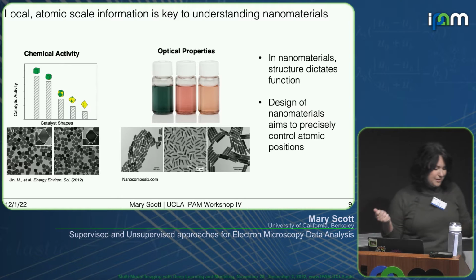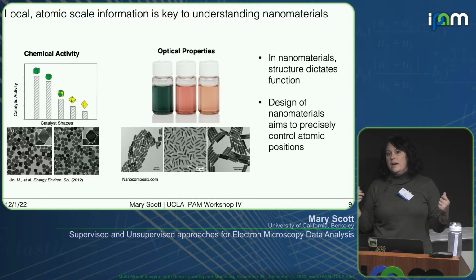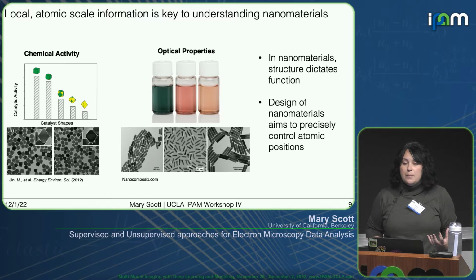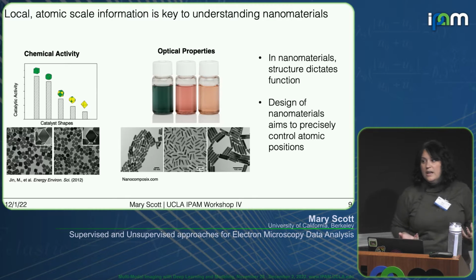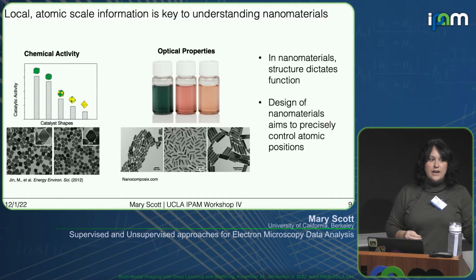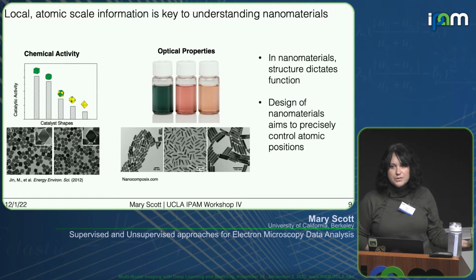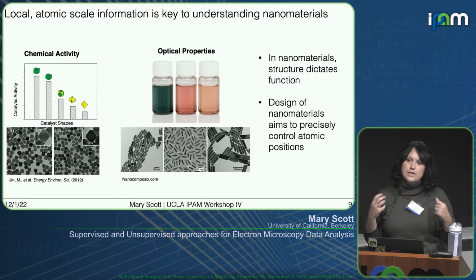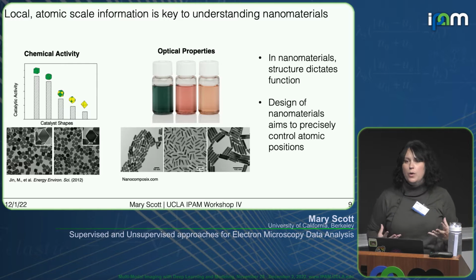However, there is a problem with nanomaterial synthesis and combining it with TEM, in that TEM, HRTEM analysis can be slow, especially if it is carried out manually. I don't know if there's anyone here who works in synthesis, but you might know that you would have to go through many, many rounds of optimizing a synthetic protocol, and you simply aren't able to image all of your reaction byproduct. And in fact, you might be only looking at the success cases, and you might not have time on the instrument or bandwidth for your graduate students or postdocs to dig deep into what parts of the synthesis protocol yielded results that didn't work, that weren't optimal.